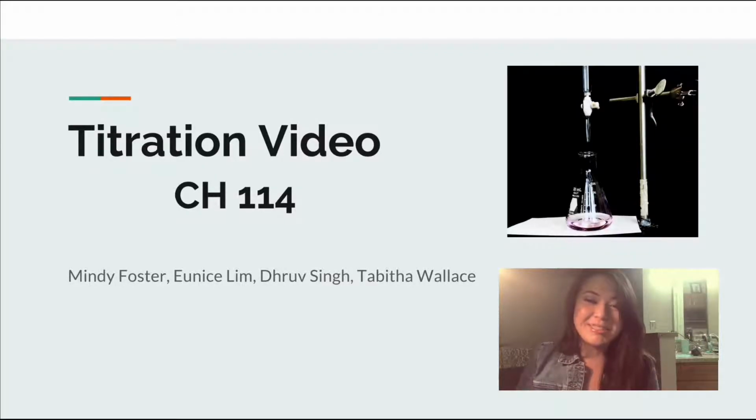Hey guys, so today we're going to be talking about titrations, which can be used in a variety of ways. Titrations are used to figure out any particular unknown by comparing the added values to a proportional standard, but is commonly used with solutions to determine many factors like pH or concentration from a solute.